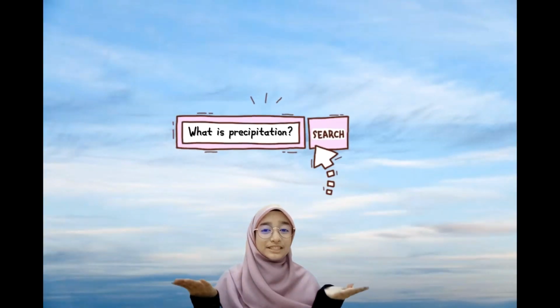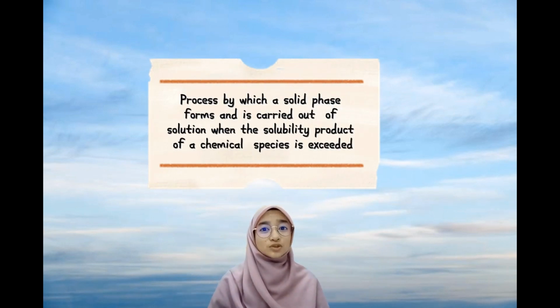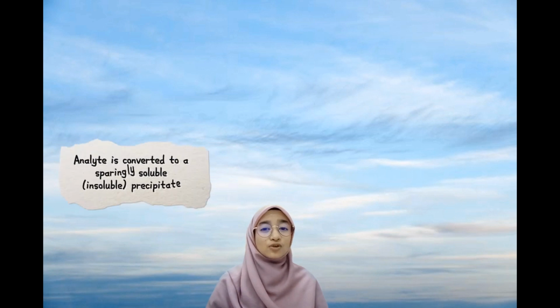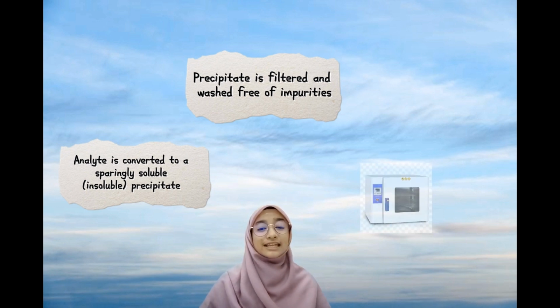Now, I will talk about precipitation. So, what is precipitation? Precipitation is the process by which a solid phase forms and is carried out of solution when the solubility product of a chemical species is exceeded. During precipitation, the analyte is converted to a sparingly soluble precipitate. Sparingly soluble means low solubility or insoluble. Then, the precipitate is filtered and washed free of impurities. Next, the precipitate is converted to a product of known composition by suitable heat treatment such as in an oven. Lastly, the product is weighed.